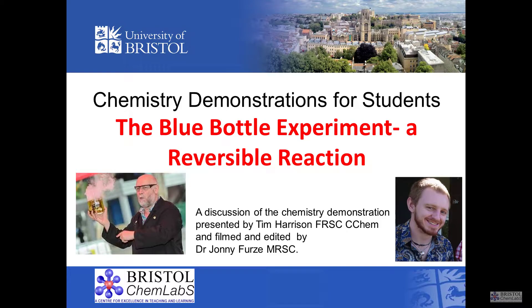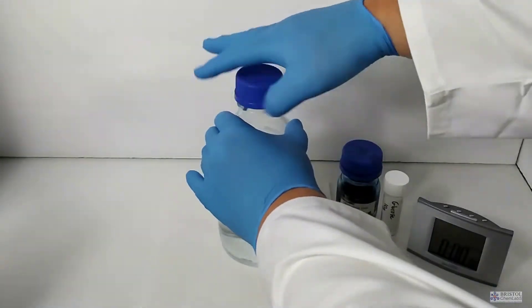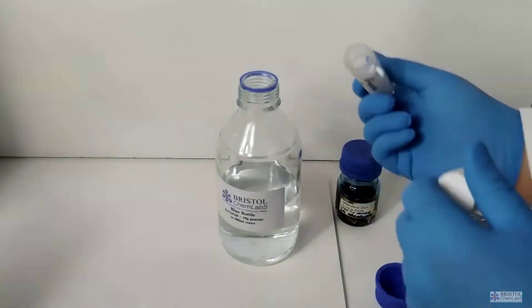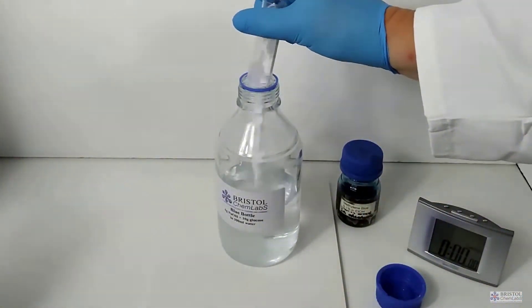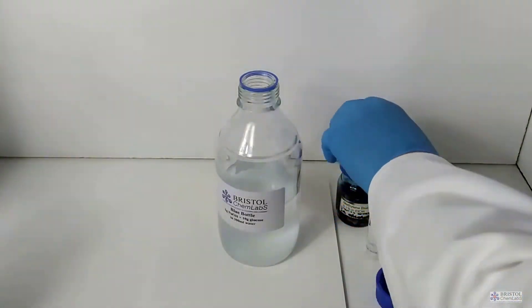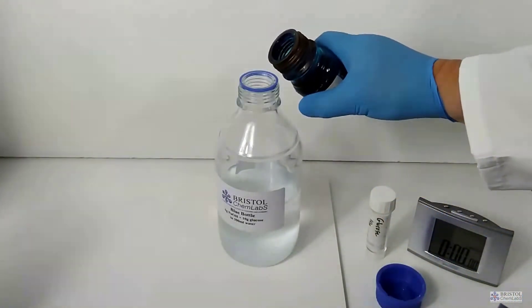In another simple experiment, the blue bottle experiment, we're going to investigate, firstly, the structural formula of a methylene blue molecule, as it's a little complex, and the nature of the simple reversible reaction in terms of reduction and oxidation. To set up a methylene blue bottle, you simply add some methylene blue indicator, which is already dissolved in alcohol, into sodium hydroxide solution, to which has been added some glucose.